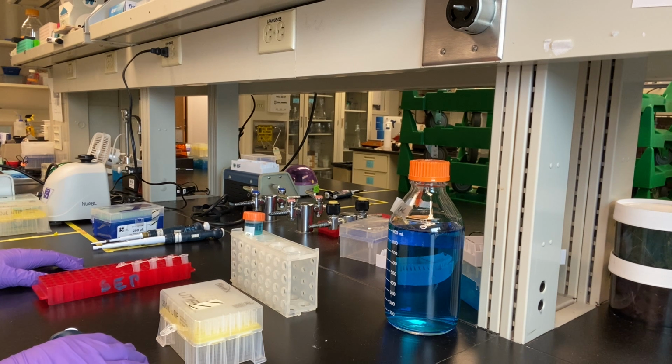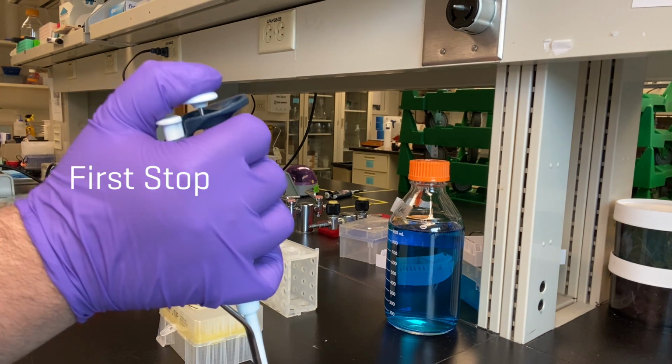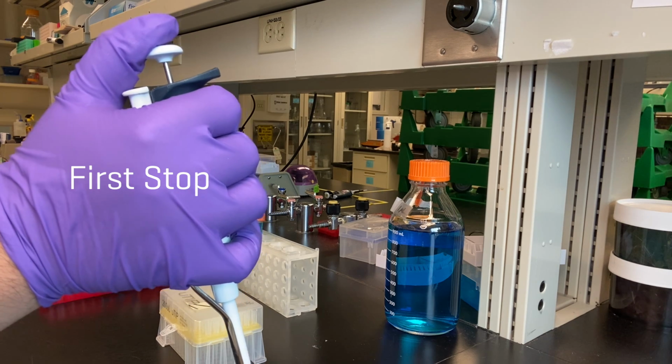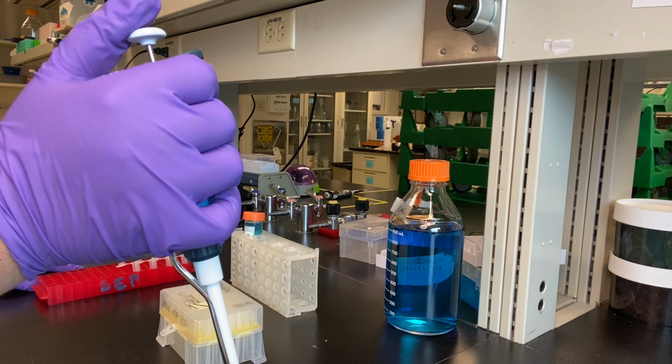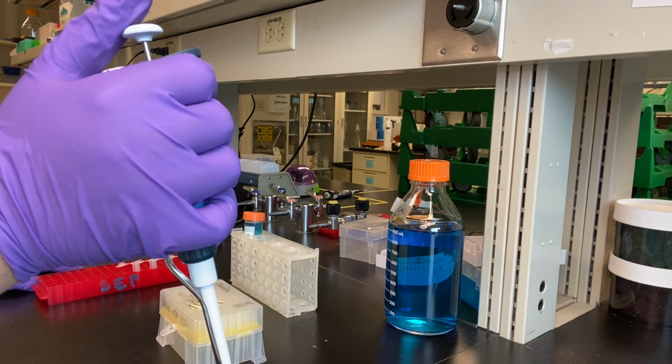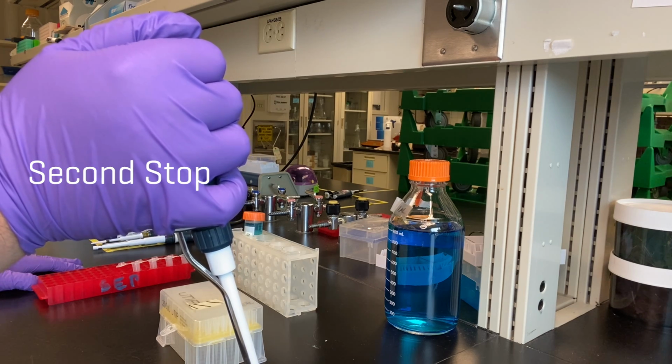A cool feature within a micropipette is the first stop and second stop. So, the first stop is to fill out the micropipette tip with the appropriate amount of volume you wish to pull up. And the second stop is to dispense the contents of the tip.